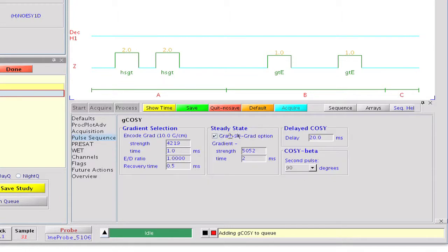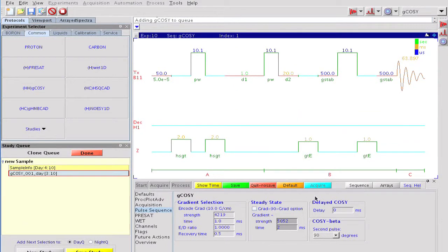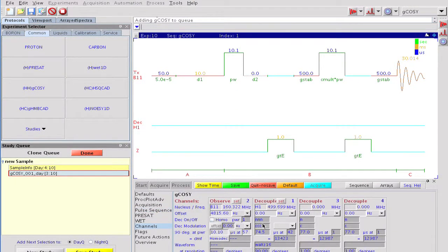Next, we deselect the steady state block at the beginning of the sequence and force the evolution time to start from 0. Finally, we turn on broadband proton decoupling during both the evolution and the acquisition period and set the modulation scheme to waltz.